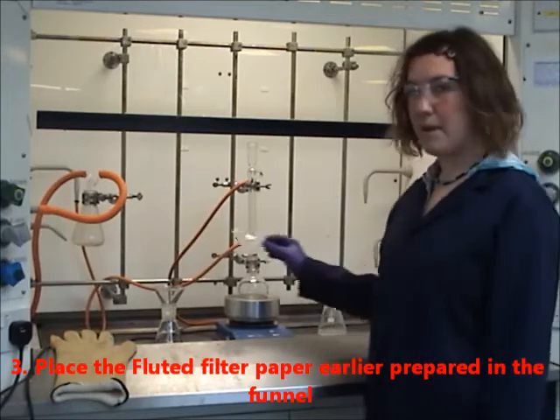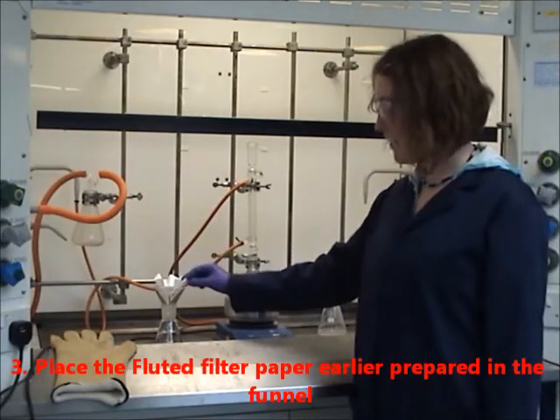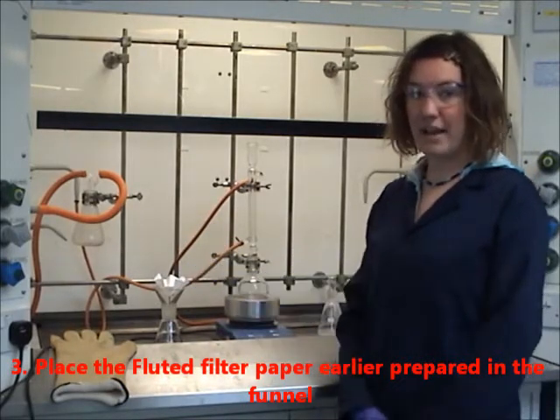Place the fluted filter paper earlier prepared in the funnel. This is to increase the rate of filtration.